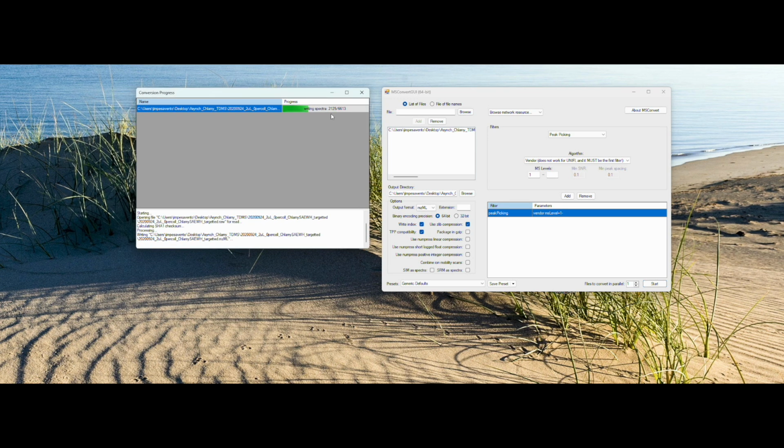So while that is working, the next step is to use a deconvolution software package to take this data and convert all the m/z information to mass, intensity and retention time information. To do that, there are two popular options that I use. One of them is FLASHDeconv, and then the other one is TopFD. Again, if you were to go and Google either of those programs, I'm sure it will lead you in the right direction.